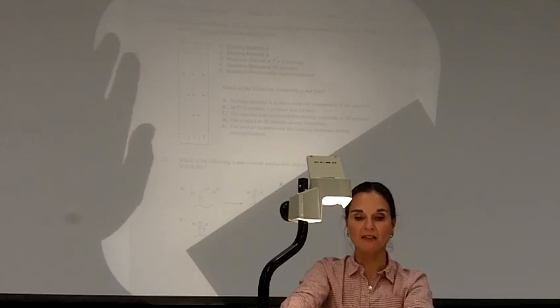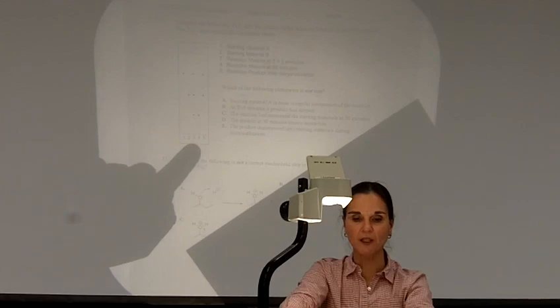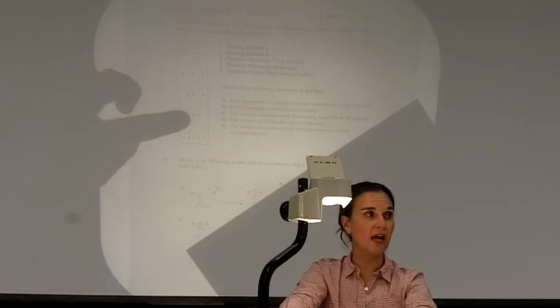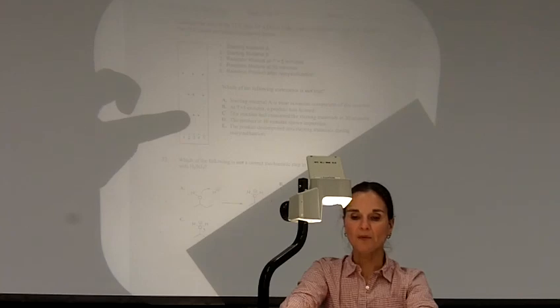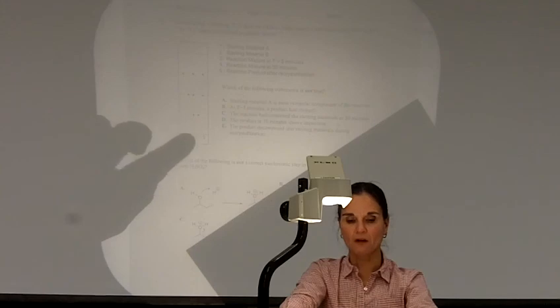At time 5 minutes, a product had formed. So at our 5 minutes, which is 3, we've got our A, our B, and then we have a new spot. So something had formed at 5 minutes, all right? The product at 30 minutes shows impurities. So at 4, that's the reaction mixture at 30 minutes.